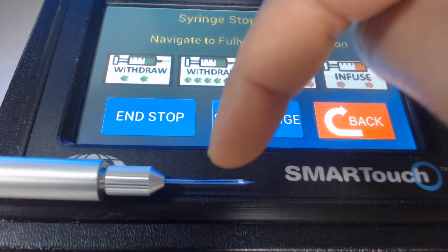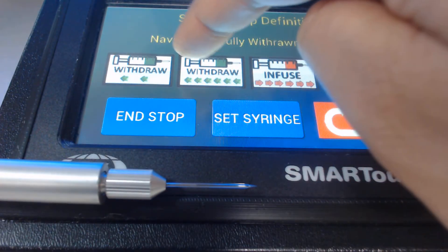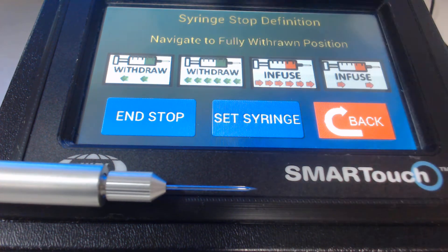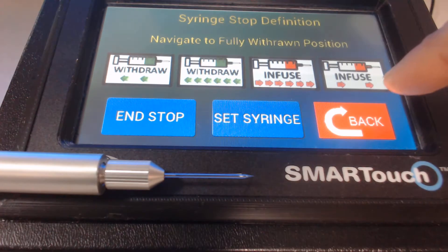Then put the glass micropipette tip inside your sample and use the withdraw button to withdraw the sample inside the glass micropipette. At this point, you have the sample loaded inside the micropipette and you are ready to inject.